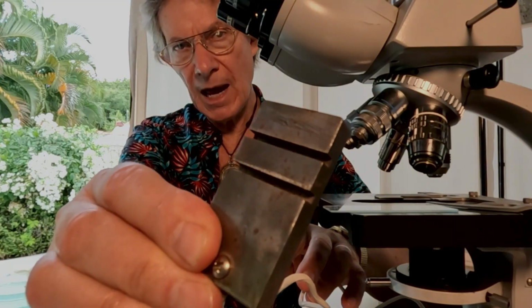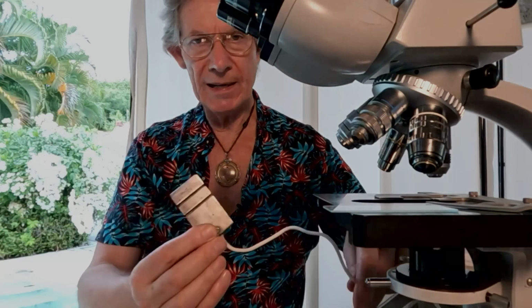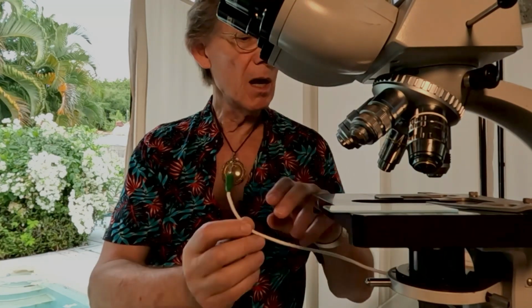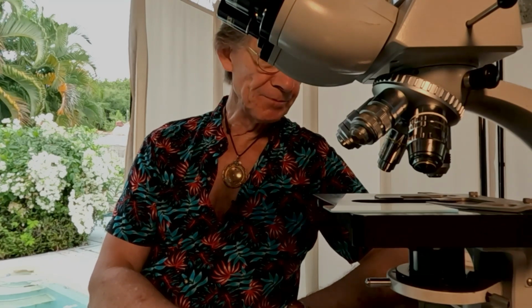So, in order to dissipate that static electricity, what I did was I came up with a special plate. And I'll hold it here, you can see it. It holds the microscope slide and the cover slip. And you'll notice there is a wire coming off of this plate, and that wire has on the end of it a single green plug. And green stands for ground. So what we are doing with this plate is grounding the microscope slide and the cover slip and removing any static electricity that has been created by the cleansing of the slide.